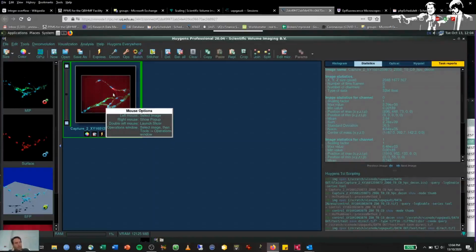It really struggles when you change zoom, especially when you zoom in and the software starts to access a higher resolution image to display, because it's a pyramidal display system. In 32-bit, it really takes a long time and it makes the whole experience much more laggy and much more annoying.